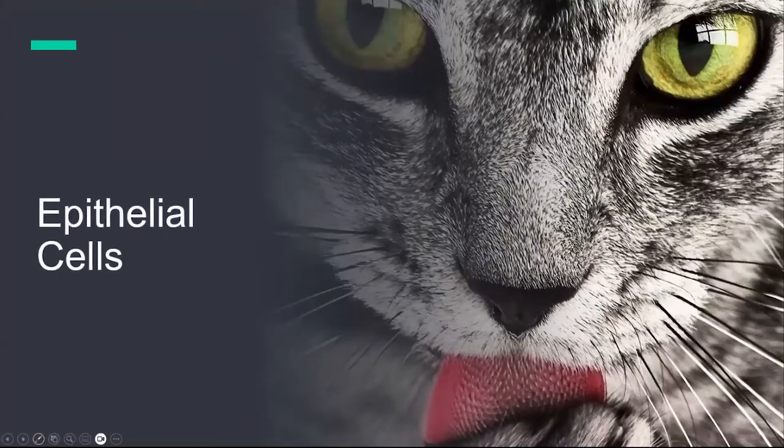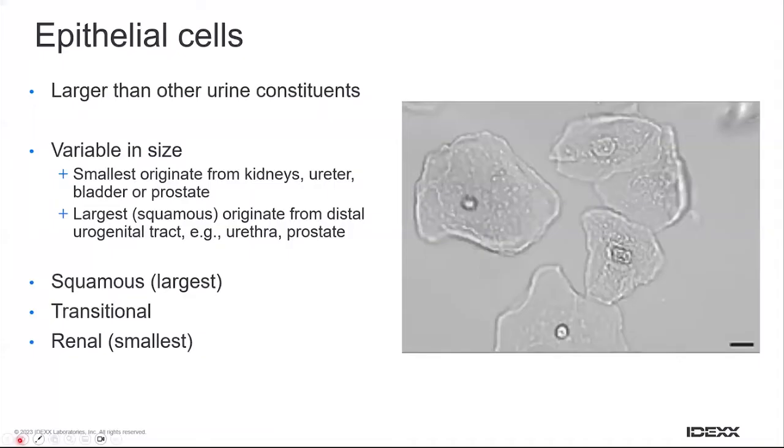So now we'll move on to what we're likely to see on that sediment examination, because many people are a little bit reluctant to confirm what they're seeing. They're not confident in their own abilities as to what they're looking at. So hopefully after this, you might have a better understanding of what you're looking at and more confidence in moving forward with the diagnosis. So we're going to start off with the epithelial cells.